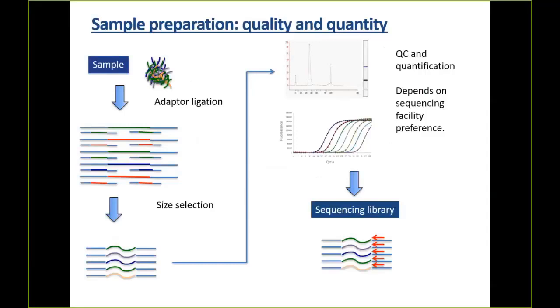Okay, that's kind of what I expected. So a lot of hands go up for libraries being made by cores. Honestly, I'm a big fan of having cores do your libraries. Cores are typically very rigorous both in their quality control and in their reproducibility for library production.